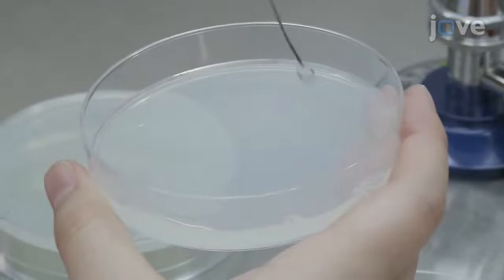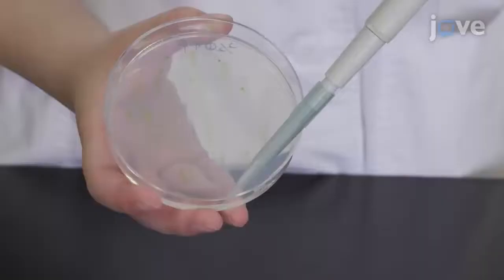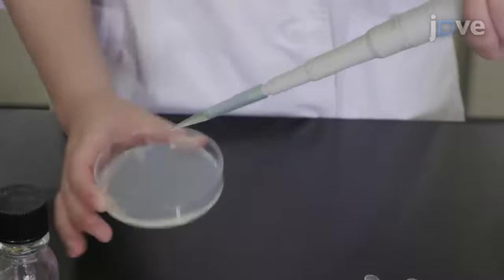To observe DNA compaction, collect the cells cultured for 6 days at the end of the light period. To release the cells from the plate, add 1 ml of 0.2 molar sucrose. Then collect the cell suspension and repeat the sucrose addition and removal until the solution turns green.